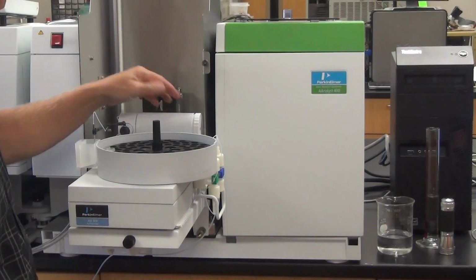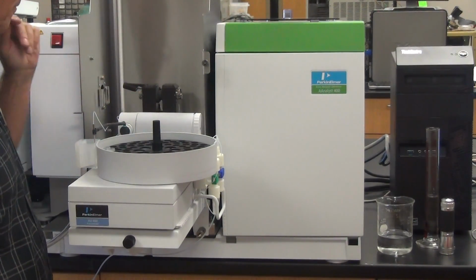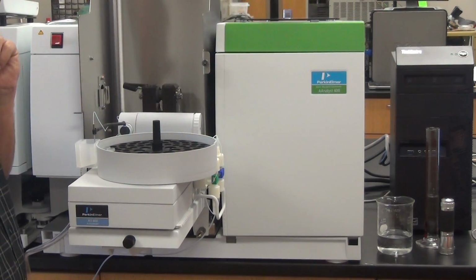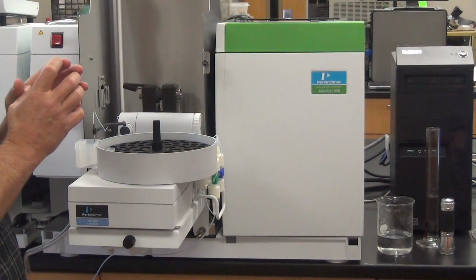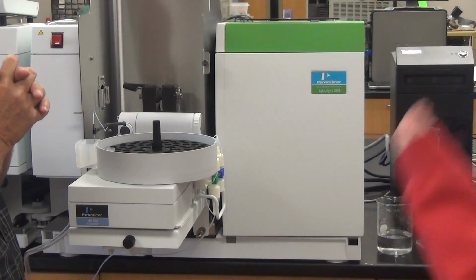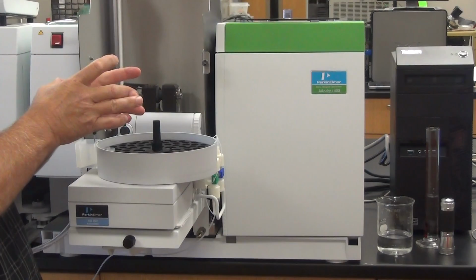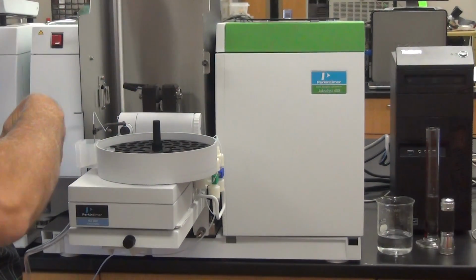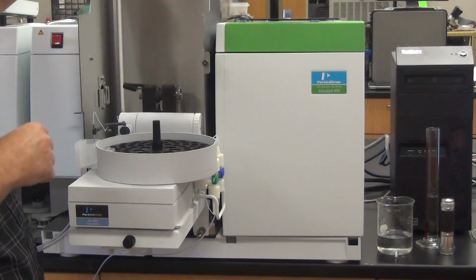Once you align the furnace, then you have to align the auto sampler to the furnace. Right. Okay? Now, if you're going to run a lot of furnace, get you a little lamp. Go to Staples or something, and get just something that's got a little lamp on an arm, on a base, and you set it up right there, or a clip-on one or whatever.